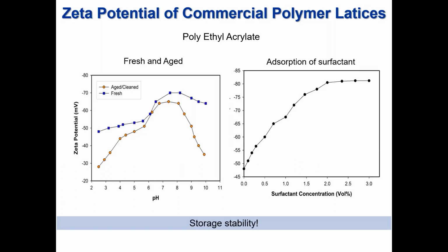As I said, polymer latex is prepared by emulsion polymerization, but typically stabilized by an adsorbed layer of surfactant, which is utilized to control the particle size. Typically, this can provide a zeta potential of around -40 to -50 millivolts in water, around pH 5 or 6. Having a high zeta potential is, however, no guarantee that a suspension will be stable under all processing conditions.